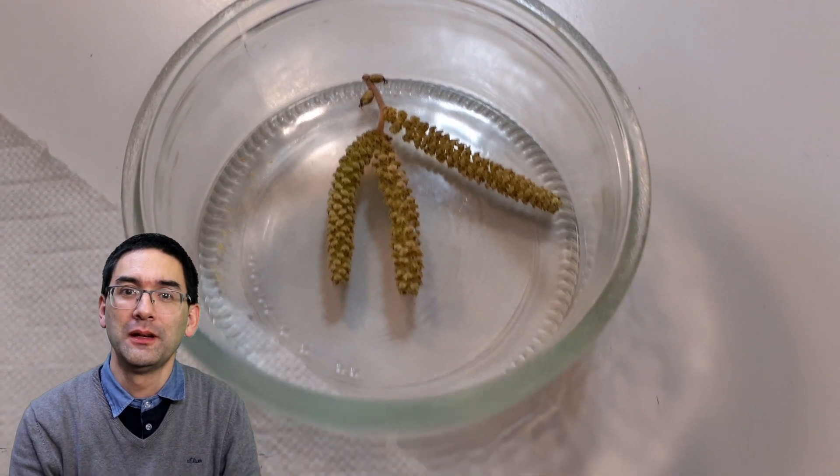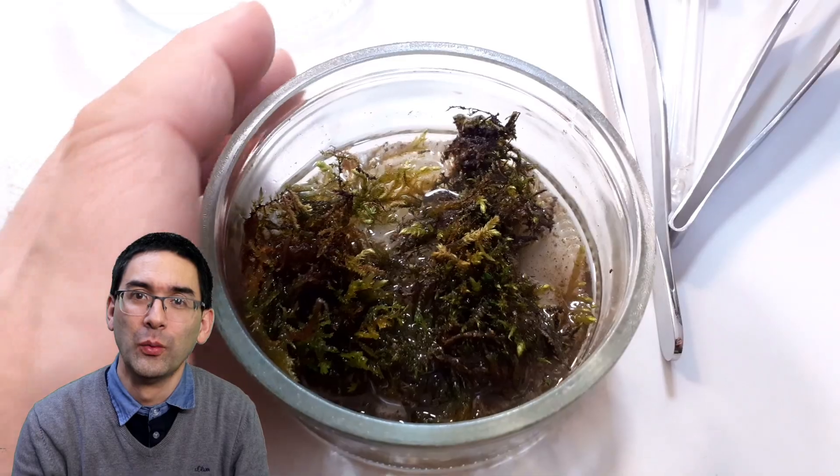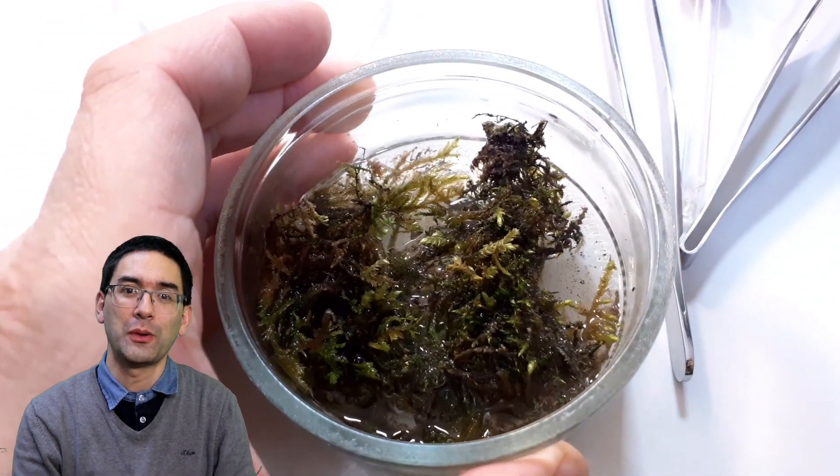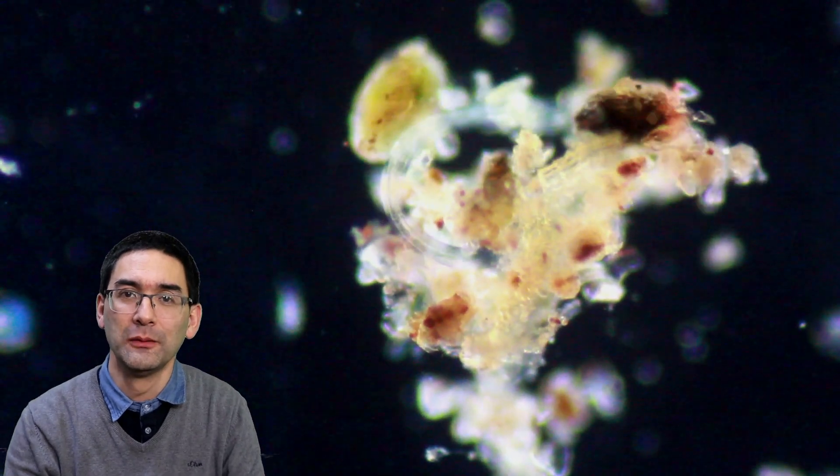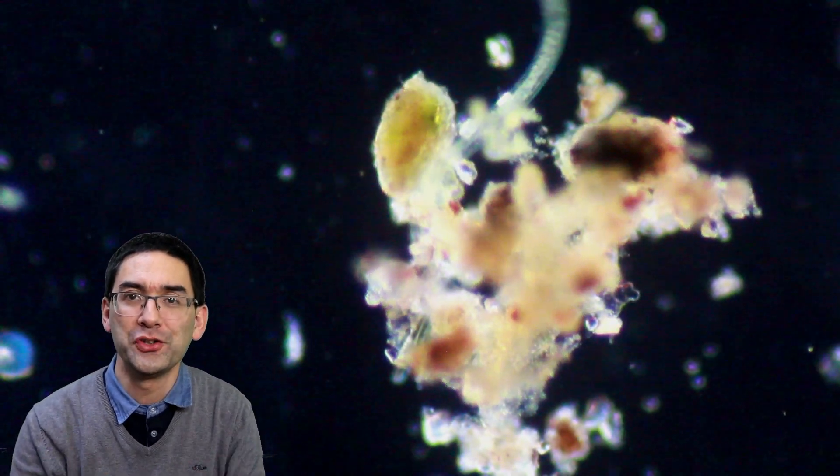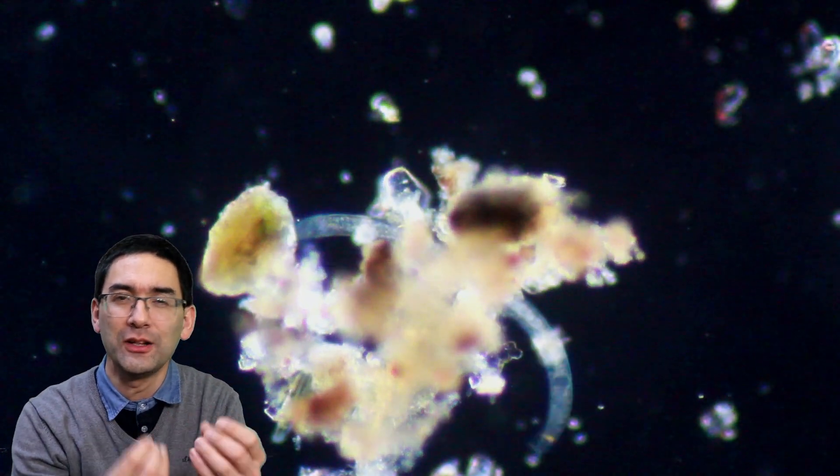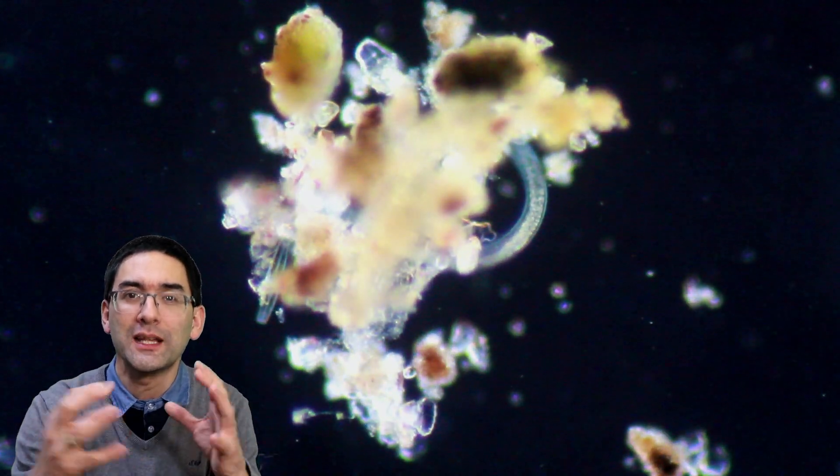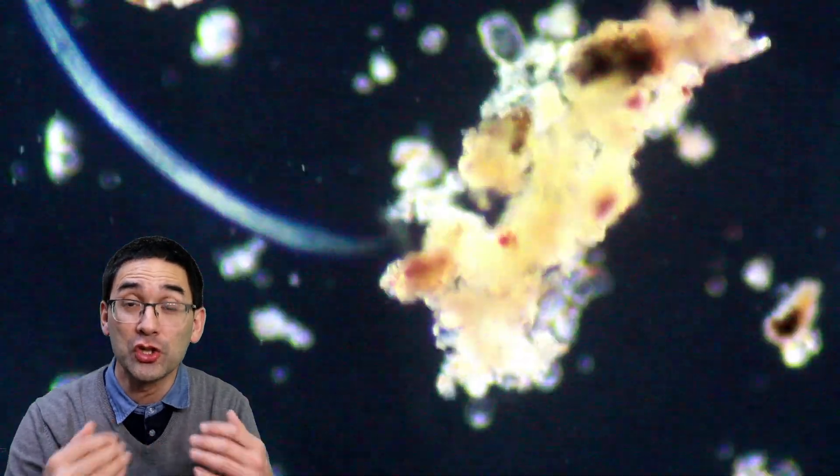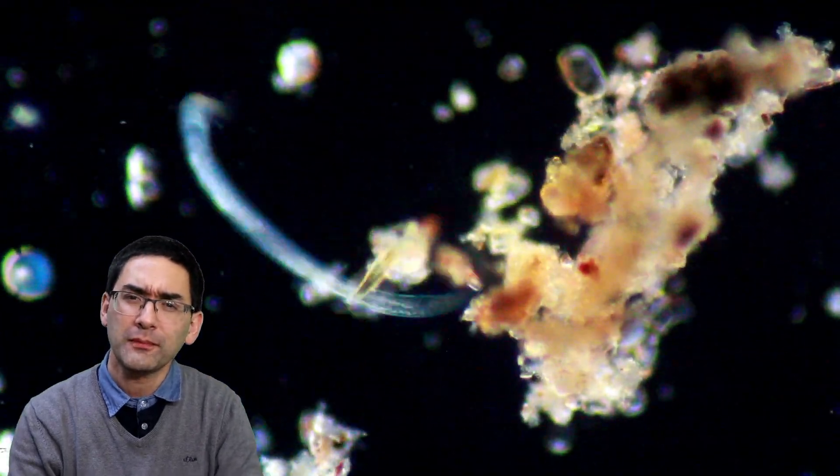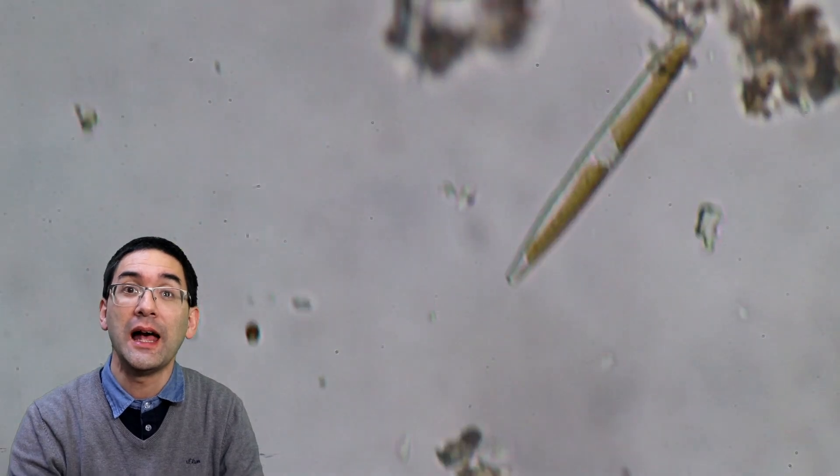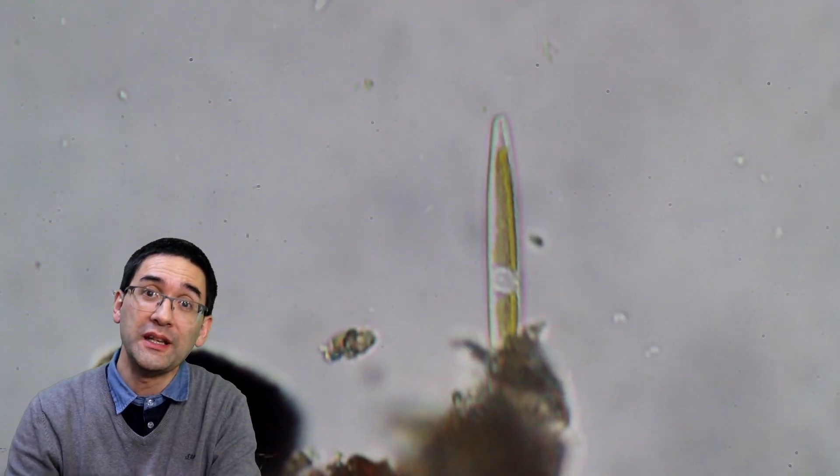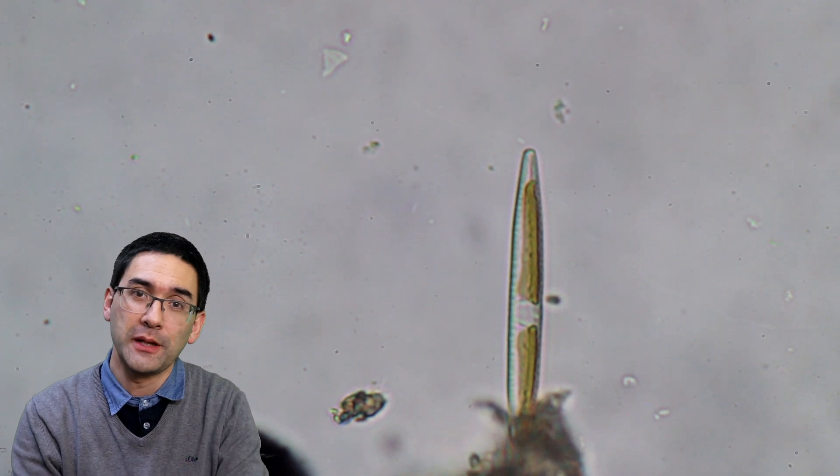I went there a second time to collect moss because I wasn't quite happy the first time. This time I saw another worm. These worms try to be around algae and debris—they weren't floating around separately but were always attached to some kind of organic material. This not only acts as food but also as an attaching surface and maybe protection. Some of these guys were moving around quite wildly. And surprise, surprise—diatoms! I thought that on moss growing next to the river I wouldn't expect any diatoms, but I found quite a few of them.